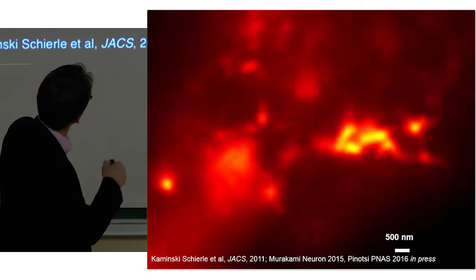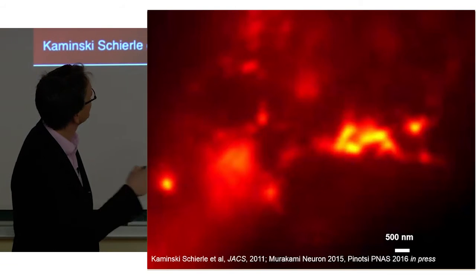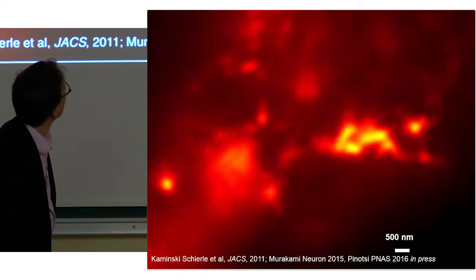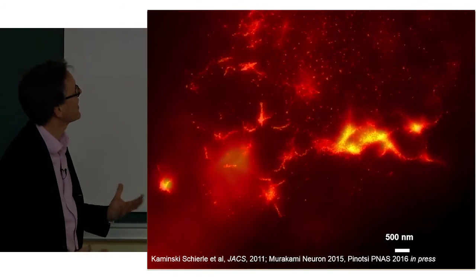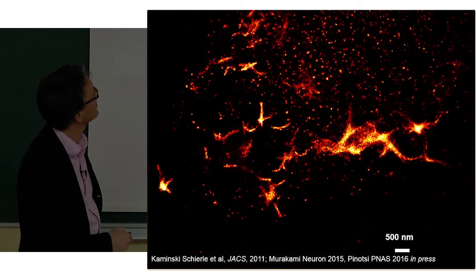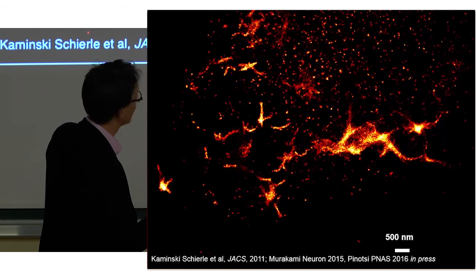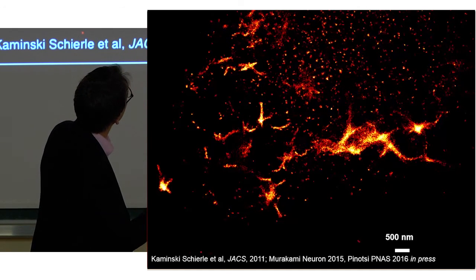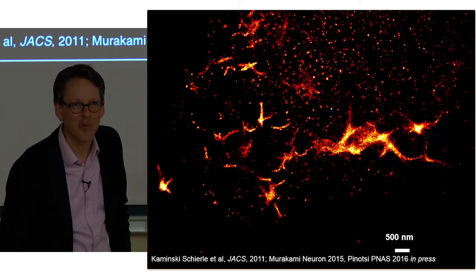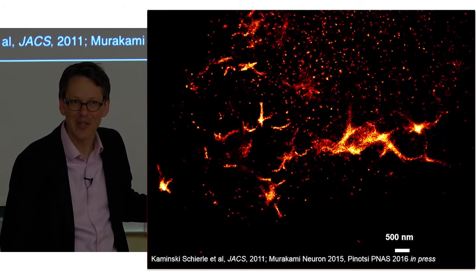And this is a wide field microscopy image, so let's zoom into this part. And so here's the image, and you see not very much. But with this technique again, with direct stochastic optical reconstruction microscopy, which is this single molecule trick, we turn this picture into that. And you see that inside the cell it's totally different. So you have some fibrils that have still formed inside, but mostly the cell seems to try to deal with the protein and prevent it from aggregating. So already you see it's vastly different information you get.